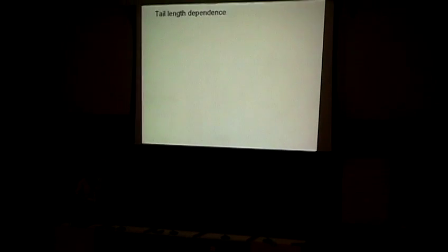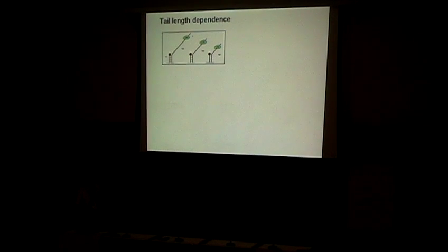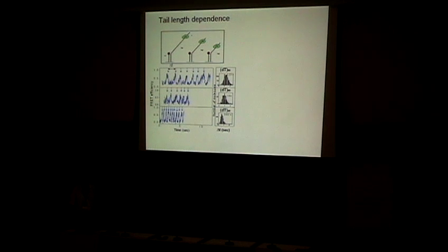Okay, so I'll just show you some additional control experiments that we have done. For example, we can change the length of the DNA from 80 to 60 and 40 bases. And the data shown here is very clear. As you make the DNA shorter and shorter, the pattern compresses, really showing that this gradual part is due to the translocation over probably the entire length of the DNA tail. And that also suggests that when you go back, you're likely going back all the way to the end, not some random location on the DNA track.